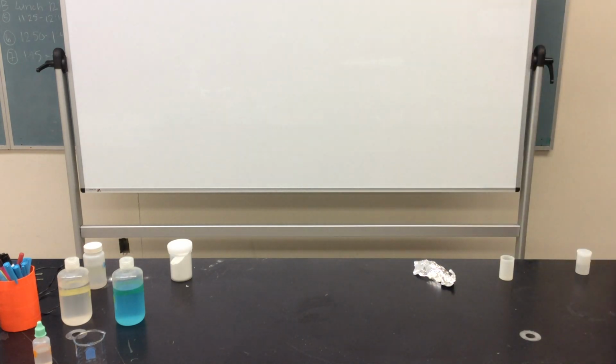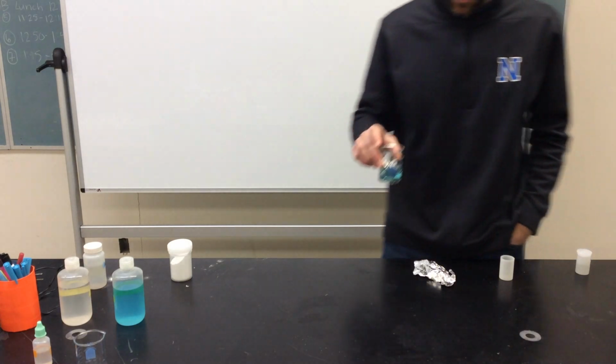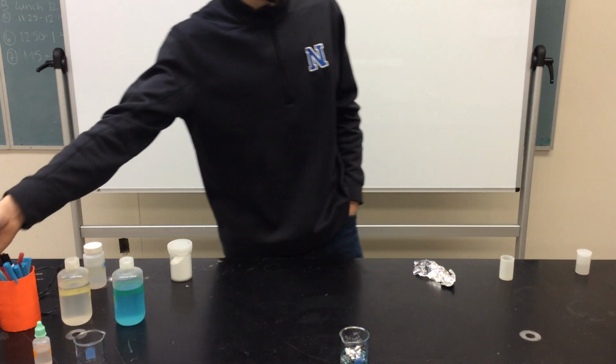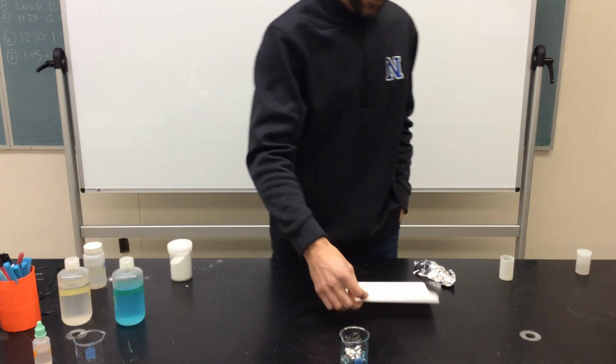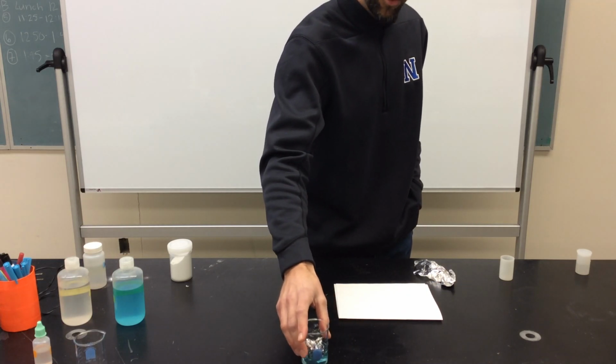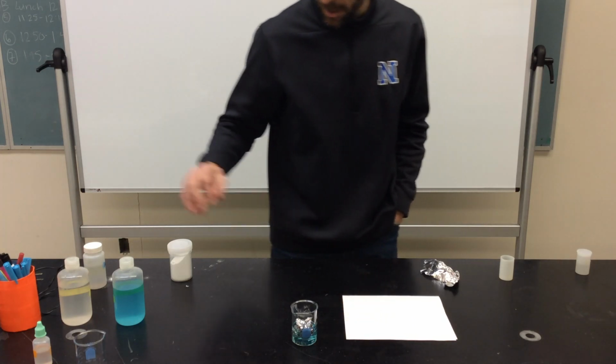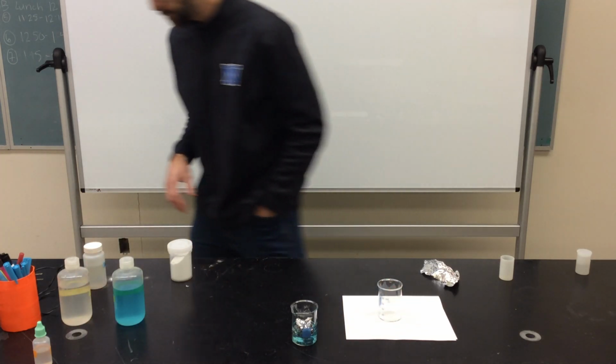I'm going to bring this over so you guys can see it. You can maybe start to see, we're starting to get some little bubbles on there, little fuzzies on our aluminum foil. And we'll come and take a look at it again in just a little bit. We're going to let this go for a little bit, and while we're doing that, I'm going to set up our next one. So we're going to let this aluminum foil and copper chloride sit for a little bit, and we're going to work with our next experiment.